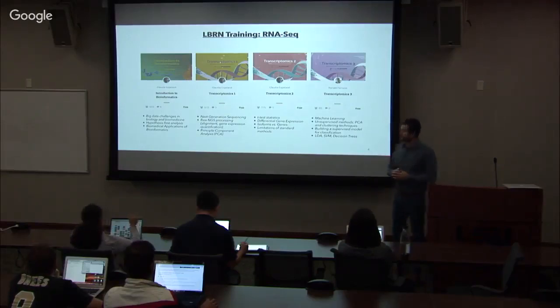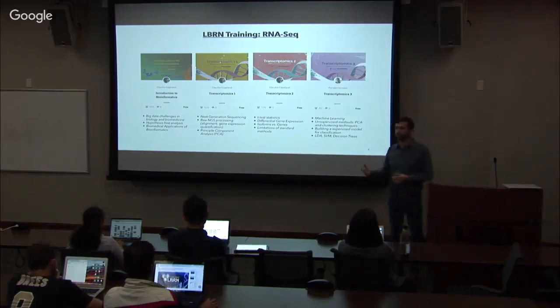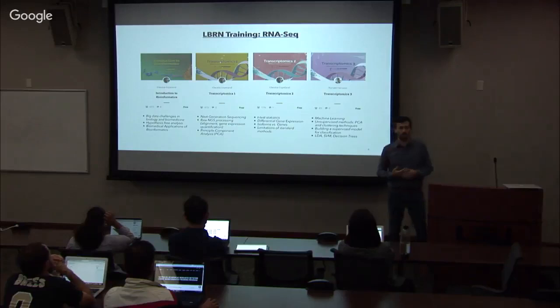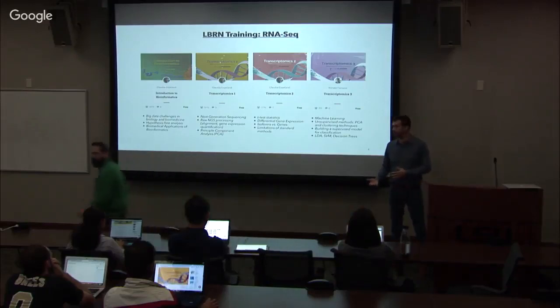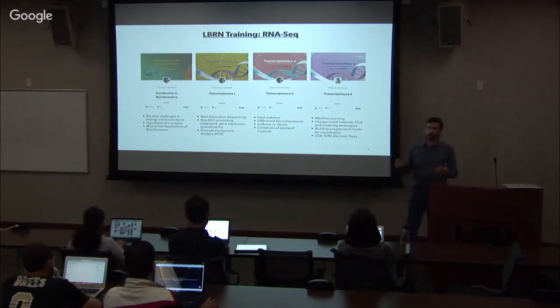After we complete these 3 sessions, we'll talk a little bit about single-cell transcriptomics. Single-cell transcriptomics is going to leverage all of these concepts that are explained in these 3 sections, because really it's an application of the same processing and alignment methods, as well as some of the machine learning methods to understand this another level of complexity that comes with single-cell RNA-seq.